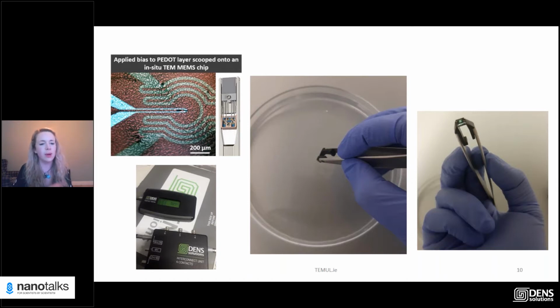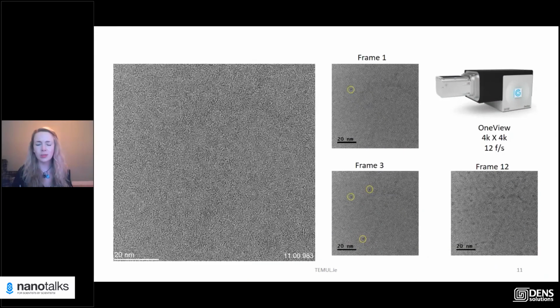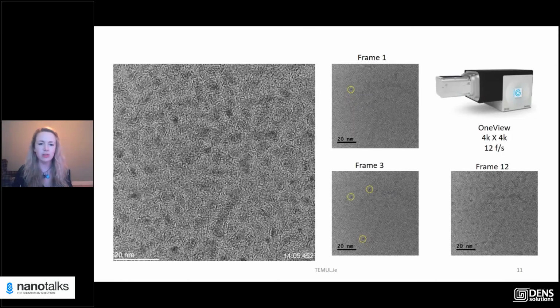So in the figure up on the left, you can see that grainy pattern on the MEMS chip is actually those larger fibers of the PEDOT material. So you can see it lies nice and flat over the chip itself. In this case, just for background, we used a four heating, two contacts, or two biasing type of MEMS chip.